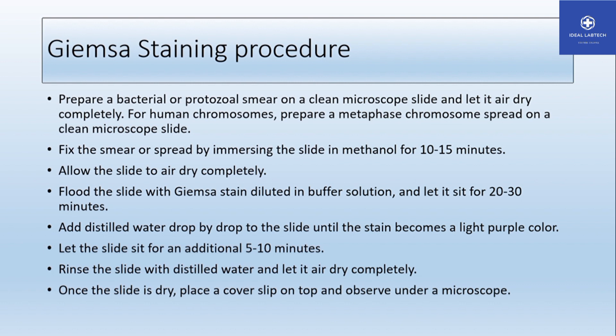After staining, apply water to wash the slide, wash the floor of the slide, dry your slide, and rinse your hands. The cells will show clear differentiation after this process.